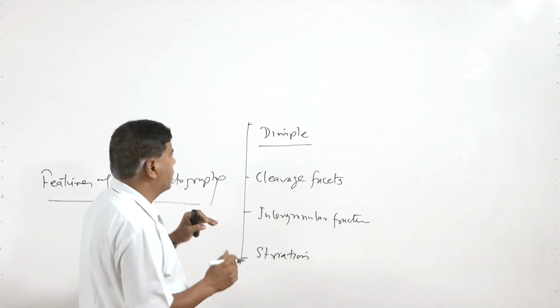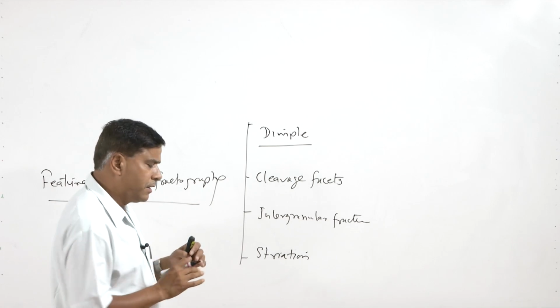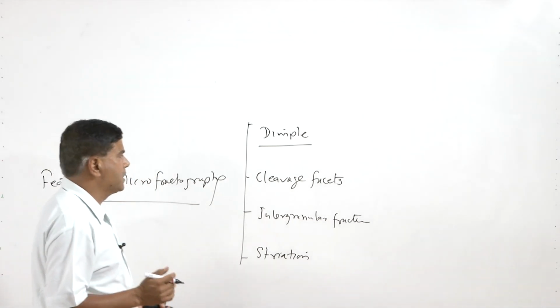We will try to talk about what these indicate and when these kind of features are observed.